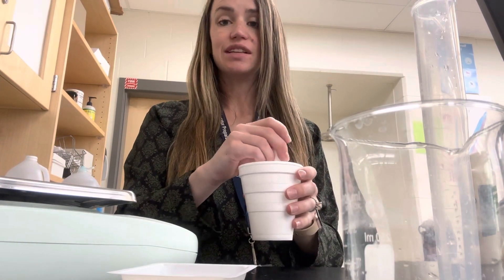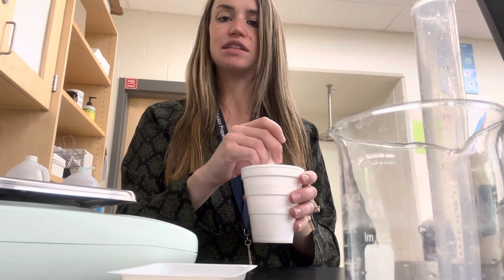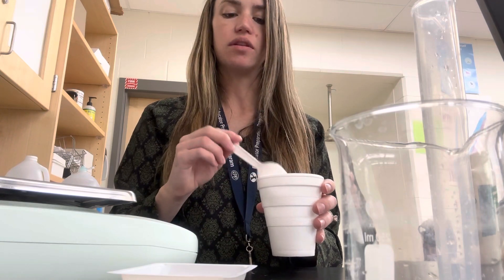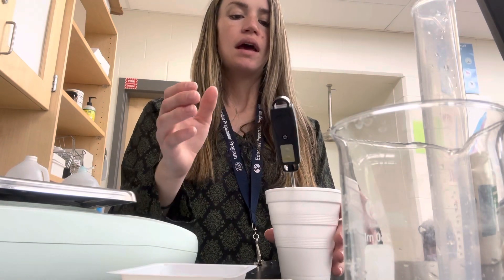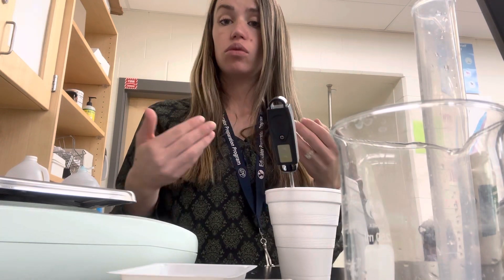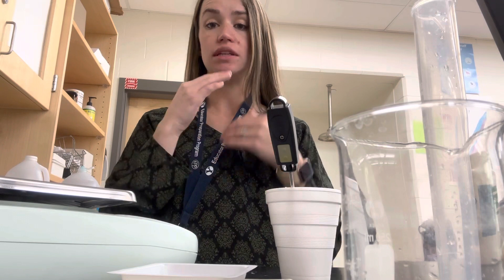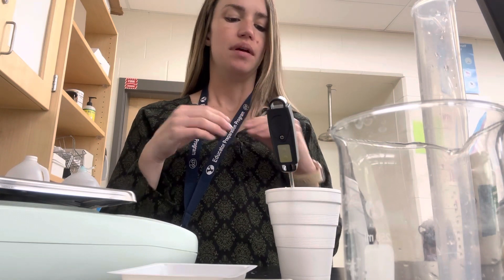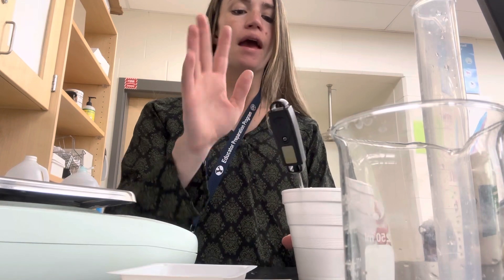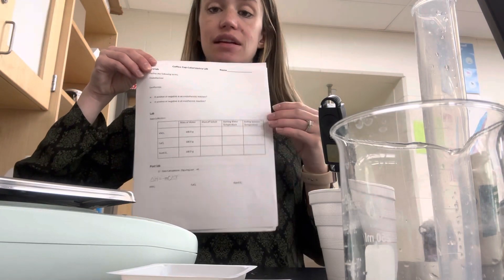Mix it for about 10 seconds — not much more than that. Some of them will dissolve faster than others, but you don't want to go much beyond 10 seconds because the reaction is starting to happen and you want to measure the temperature. Then put your thermometer back in and wait for it to stop moving — let it sit in there for about a minute. The temperature is changing, either going up or down. After about a minute, record the number on your data table as the ending temperature.